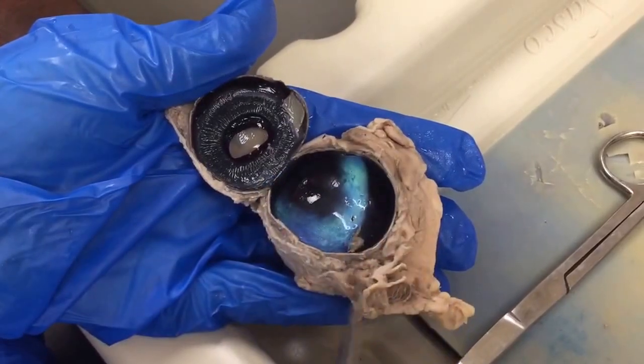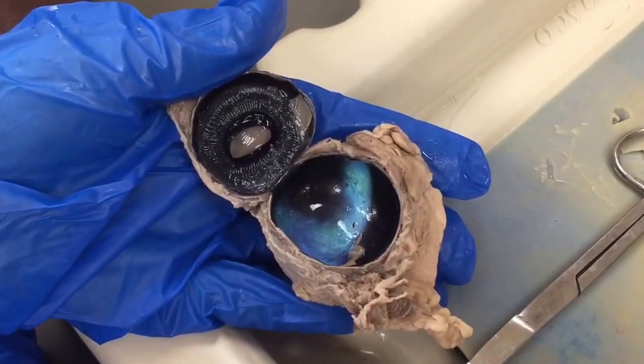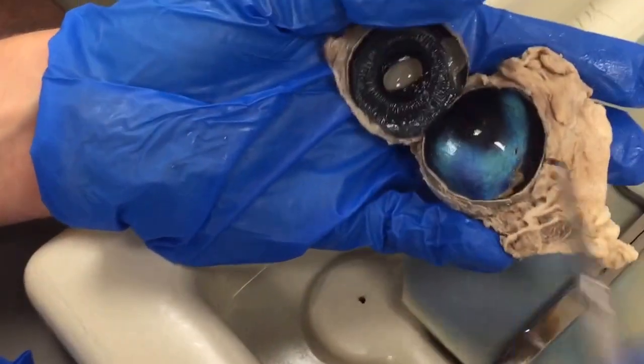You can still see some of the sclera, the white of the eye surrounding. And the optic disc is the little guy.